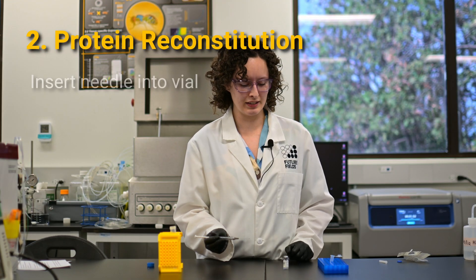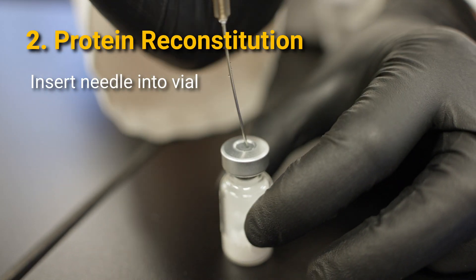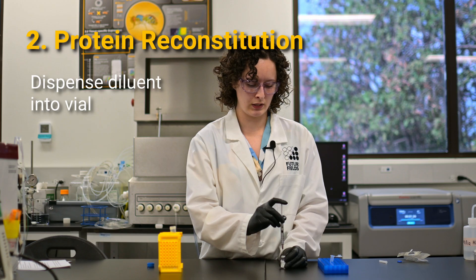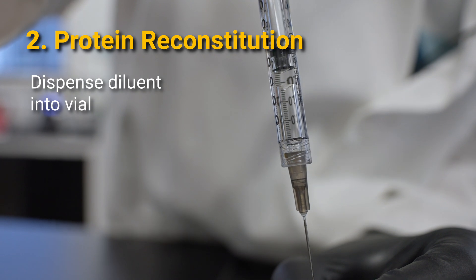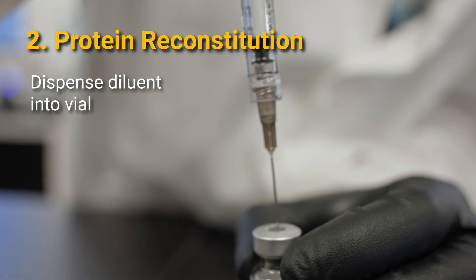Insert the needle into the rubber stopper of the vial without touching the lyophilized product. Dispense the liquid into the vial without forcing it. If you need to, allow air to come back up into the syringe to equalize the pressure and slowly work the liquid into the vial.